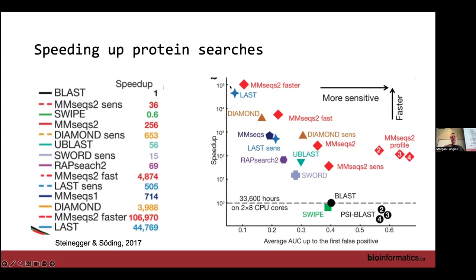This is probably a good point to note here a little bit. See this disease fun factor here. Sometimes, obviously, genes overlap between microbes and humans. Like there's actually homology, right? And so because of that, you will see sometimes genes associated with the disease in some of these functional databases. And it's not because the gene in the microbe is causing that disease. It's because the gene is in humans and has been associated with the disease. So yeah, you just want to watch out for that. It'd be cool if we get to the point where we have a functional database where the gene in the microbe is associated with disease. But right now that doesn't exist, beyond, obviously, if it was describing a pathogenicity factor, but that's definitely not what KEGG is describing here. It does do virulence genes, but it wouldn't usually be under disease as far as I know. No. Yeah. Okay, so that's great.